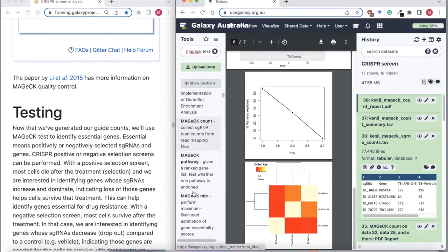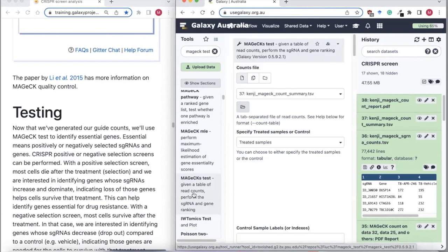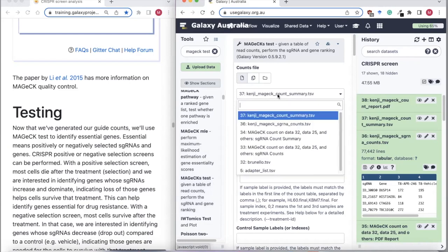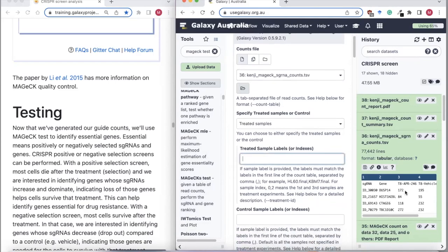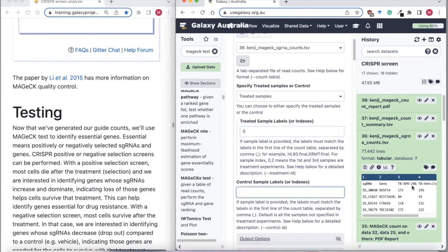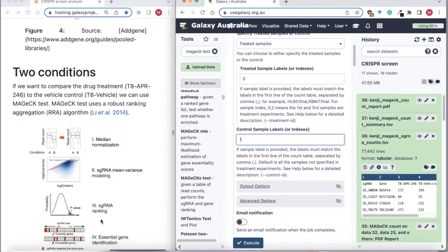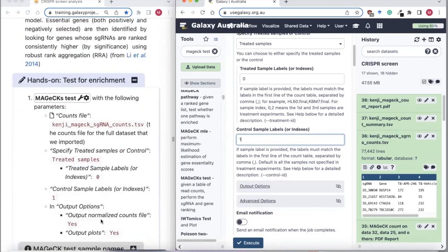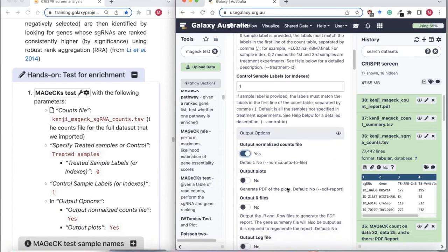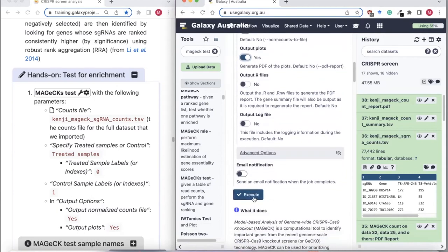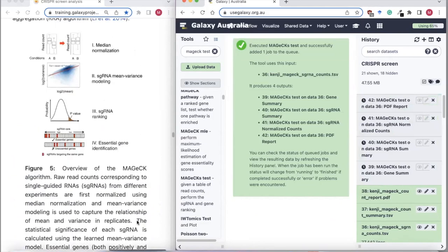For MAGeCK test, we want to input the guide counts. We will specify that our treated sample is in the first column — column zero — and we want to compare that to our control, the vehicle sample, in column one. We want to output a normalized counts file, which is useful if you want to plot normalized count values for different genes and guides. We'll also choose to output the plots, and execute.